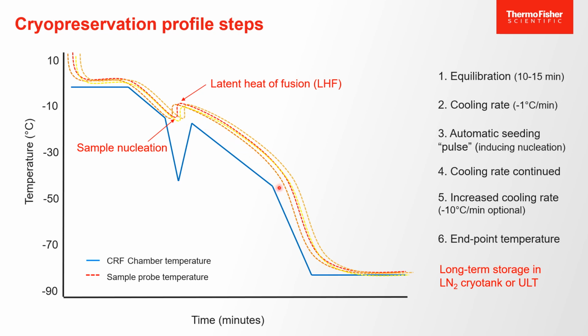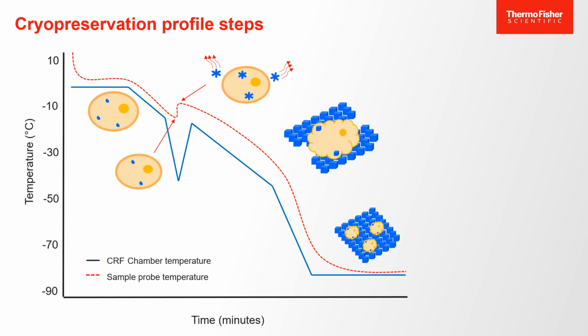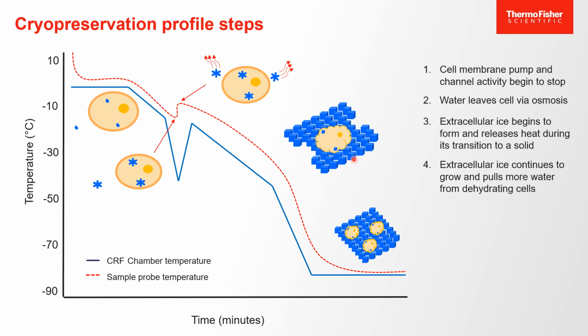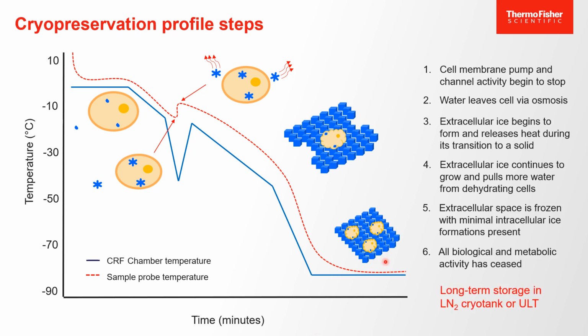So this is a follow-up to that. What is actually happening to the cell in those steps? You're getting the water leaving the cell. You're getting some ice formation both inside and outside the cell, and it's better to have extracellular ice. You get that little release of heat. Here you saw the little heat wiggle, but that extracellular ice is actually helping balance more removal of water. And so while the ice at this point isn't necessarily cubic type of ice, it's still building upon itself, and it's still okay to have ice at those edges, right? And now you have your neatly stored cells basically preserved, with minimal chance of any enzymatic activity.